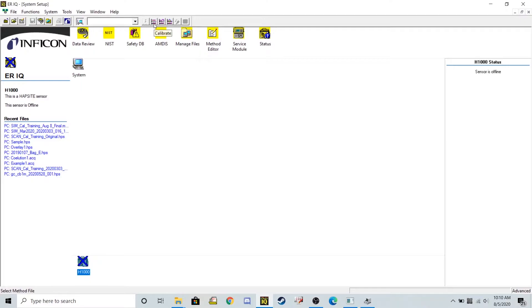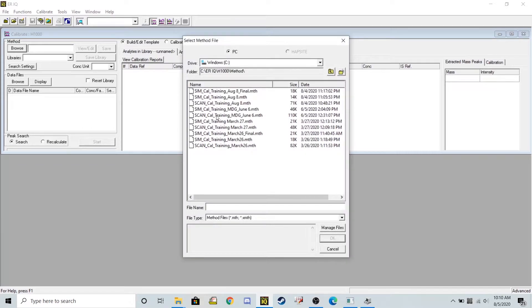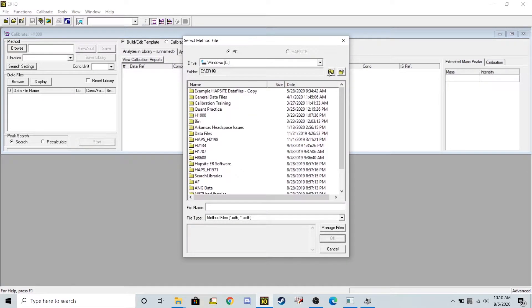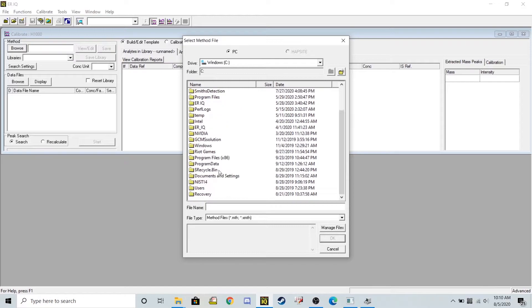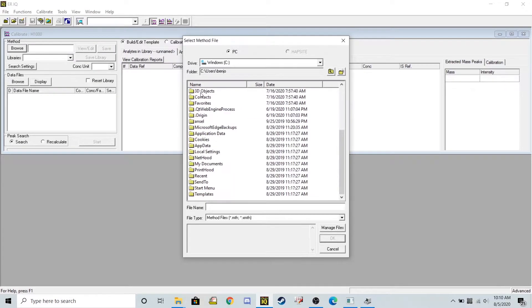To start I'm going to hit this calibrate icon at the top toolbar and I'm going to select a generic method that I know my chemicals of interest can be seen on. So I put this generic method on the desktop of my computer so I'll navigate to it.